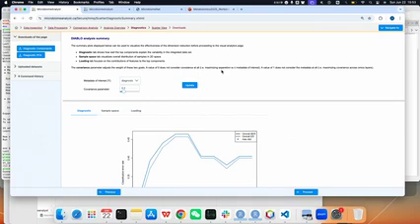It will maximize the group difference totally based on the metadata. And if you increase this value to 1, then basically you won't consider the metadata. It's like unsupervised. It's just maximizing the covariance across the omics layers.